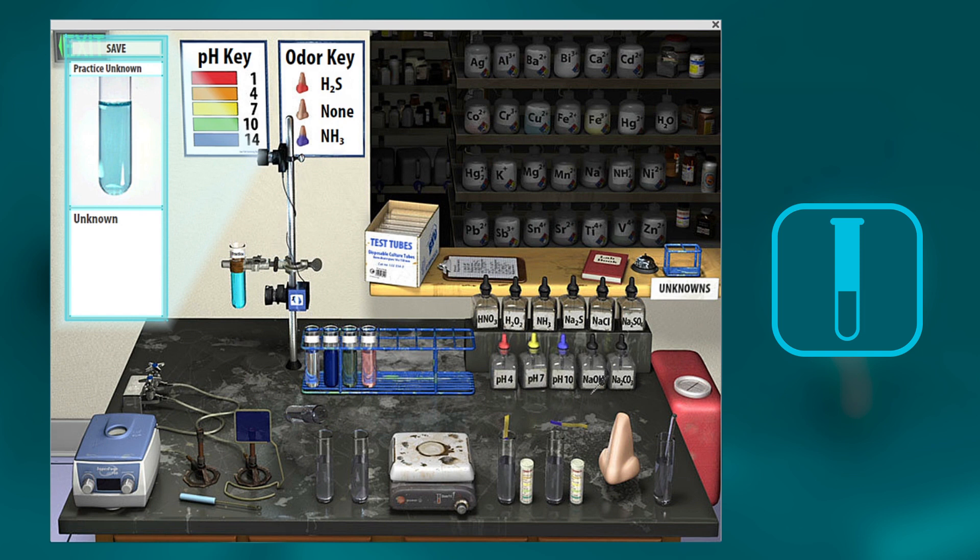We added some sodium hydroxide. So you see it doesn't tell you what's in there again. Now when we centrifuge and decant.